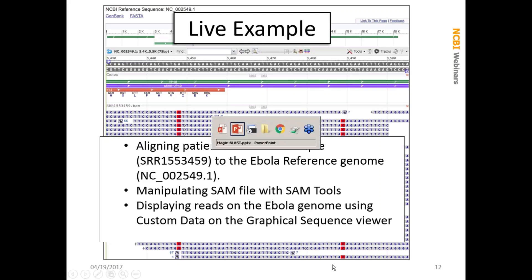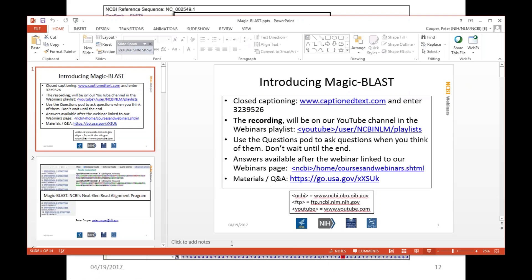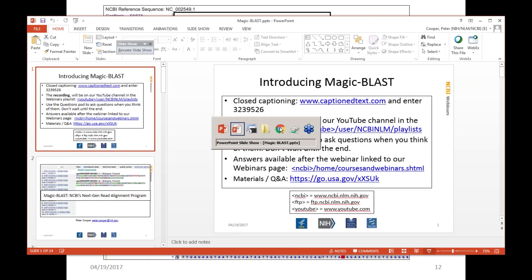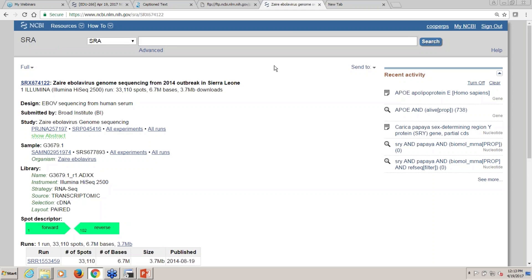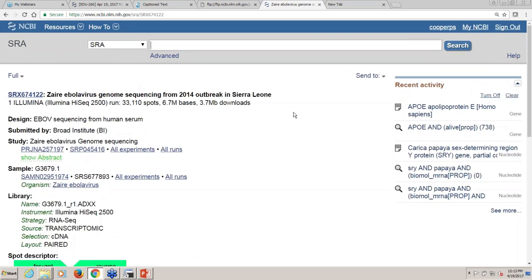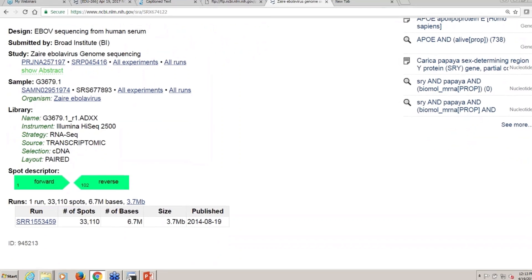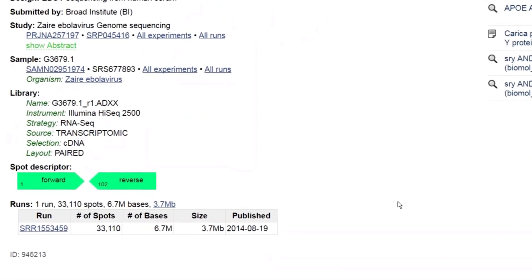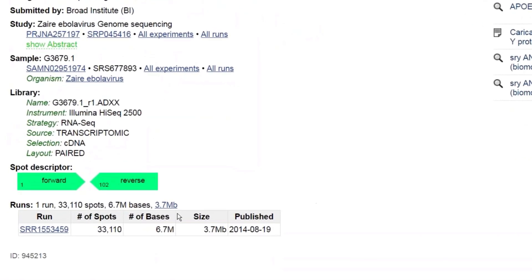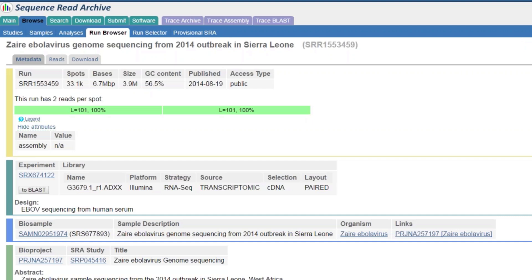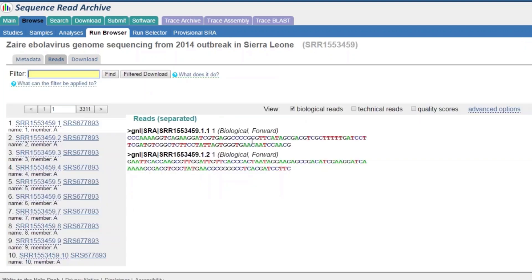What I want to do now is leave this and go to the web browser. We'll take a look at the experiment in SRA. This is the Zaire Ebola virus genome sequencing from the 2014 outbreak in Sierra Leone. This is an isolate from a single patient. It's a fairly small run with only 33,110 spots. That's why it's easy to do this in a real short demo. If I look at the run, I can see that this has paired reads. So I want to keep that in mind when I do the alignment.